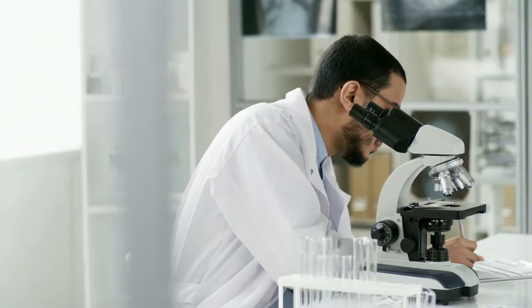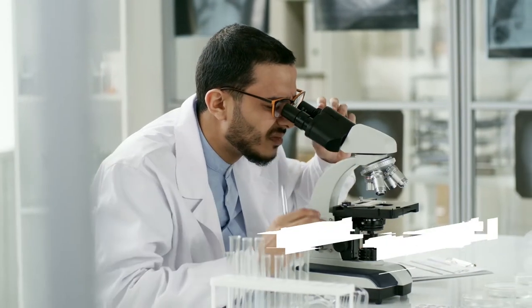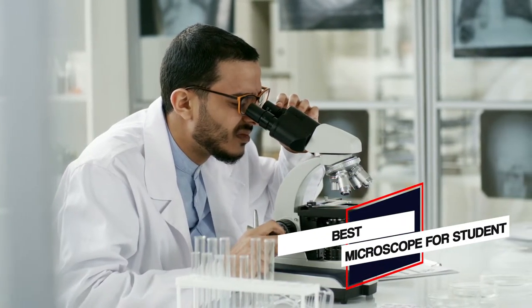In this video, we'll show the 5 best microscopes for students on the market that will help you to choose the best one for you. So let's dive into the video.